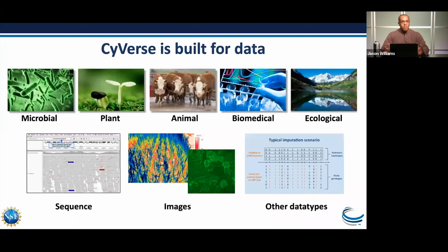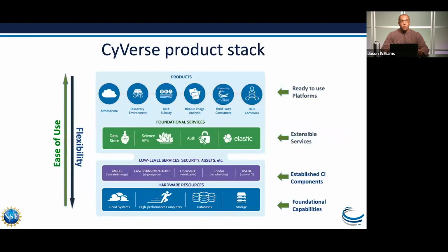If you don't know about CyVerse, it's really suitable for all types of data. We're going to be talking today about RNA-Seq. I'll give you a little bit of a preview of the purple line, which is going to be for looking at metabarcoding, metagenomics at the very last end slides that I have. But it's really a hub for data, and I encourage you to take a look at some of the other capabilities that are there. For those who may not know what some of those are, one of the ones that we're using today is the data store.